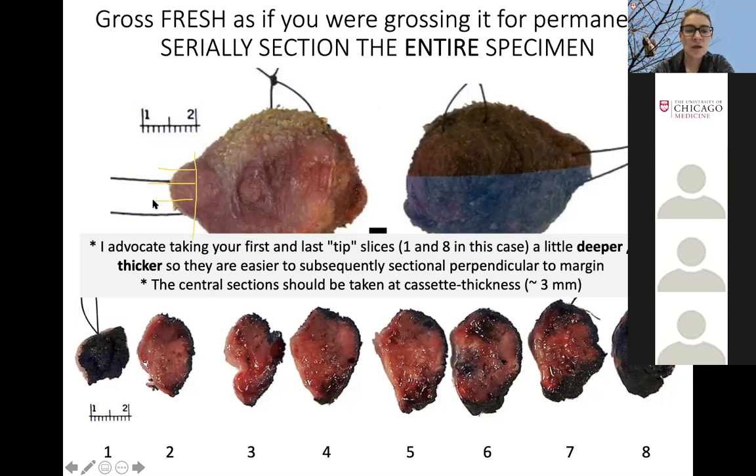Does that make sense? So this is fine if the thickness of your tips is deeper or thicker than the thickness of your individual slices, because remember, we're going to be embedding these in different ways. So that's all I have to say about that. Questions?